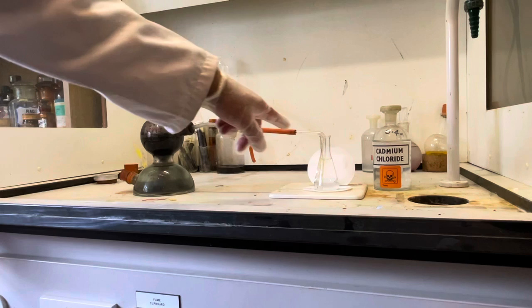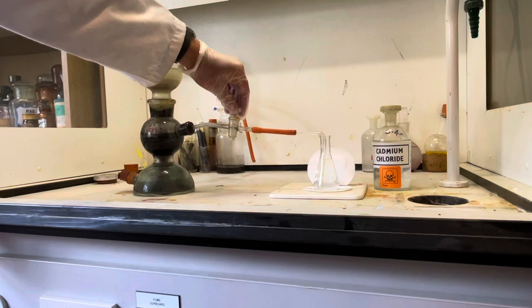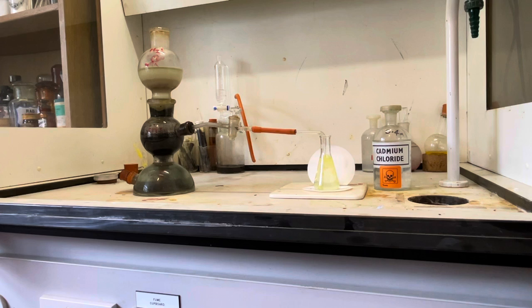Without further ado, we're going to bubble this hydrogen sulphide gas into this little flask containing the cadmium chloride — let's do it nice and slowly. Almost immediately we see the lovely clear liquid turning into a beautiful golden yellow liquid. What we're getting is very fine particles of cadmium sulphide, which will separate out into a heavy precipitate.